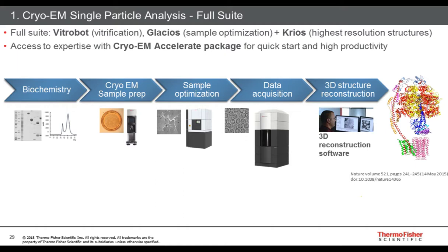Basically, it's the philosophy of Thermo Fisher to have as many Glacios and Arctica, Talos, the same instrument, in 2 facilities next to a Krios. The Krios is of course an instrument that is run quite often 24/7. You want to use it to the maximum, in a maximum optimal state. That means you want to use it for acquiring high resolution images.